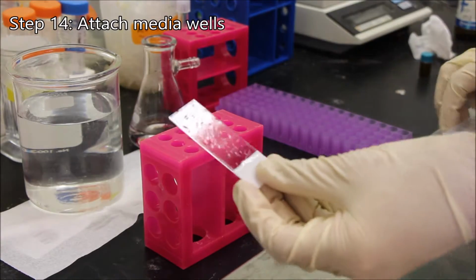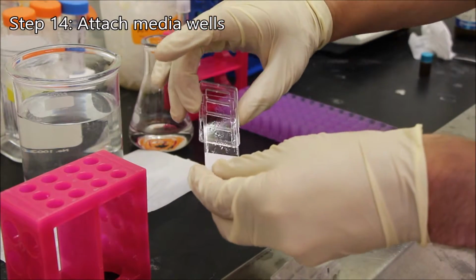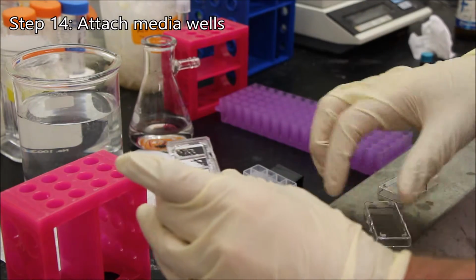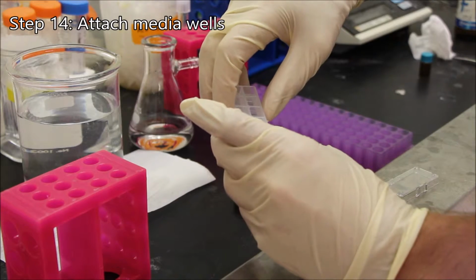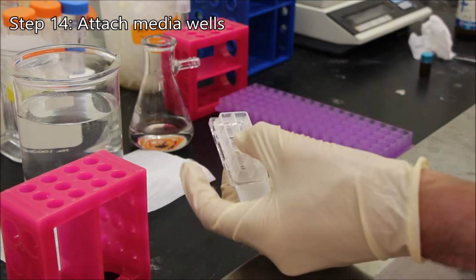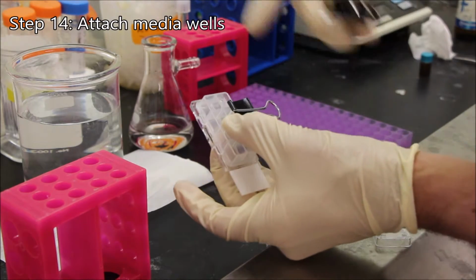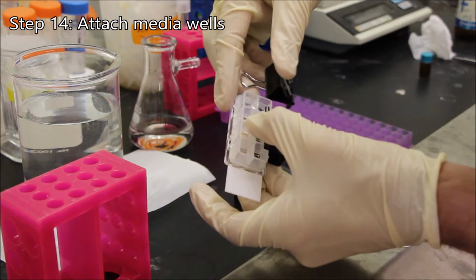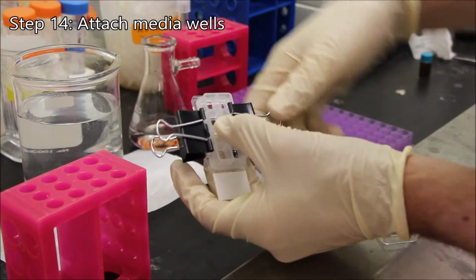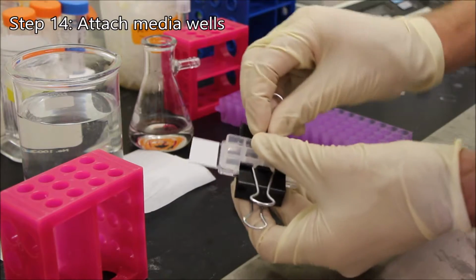I'm going to do this again. Place it in the holder. Add the media chamber. Place the first clip on the upper side, and this just prevents the media well from flying away. Three steps.